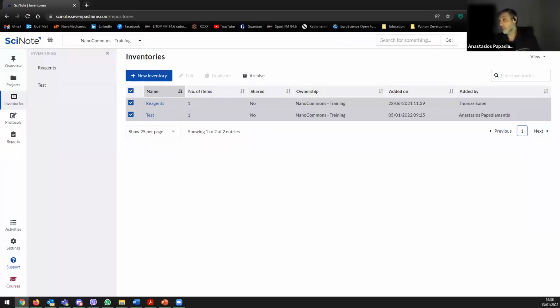You don't do it alone. If you want to work alone, you can create a team of which you are the only member, and have your own personal repository to try weird, crazy ideas, crazy protocols, deviations, or create something new without inviting anyone. In this case, you will be the only person able to access everything within this team.